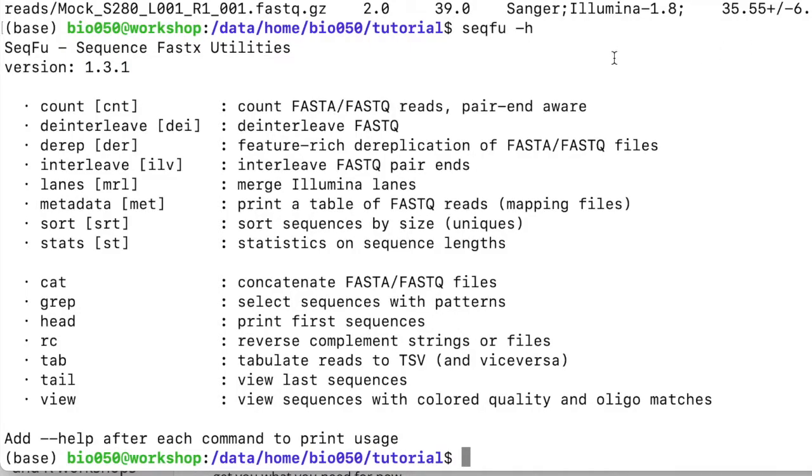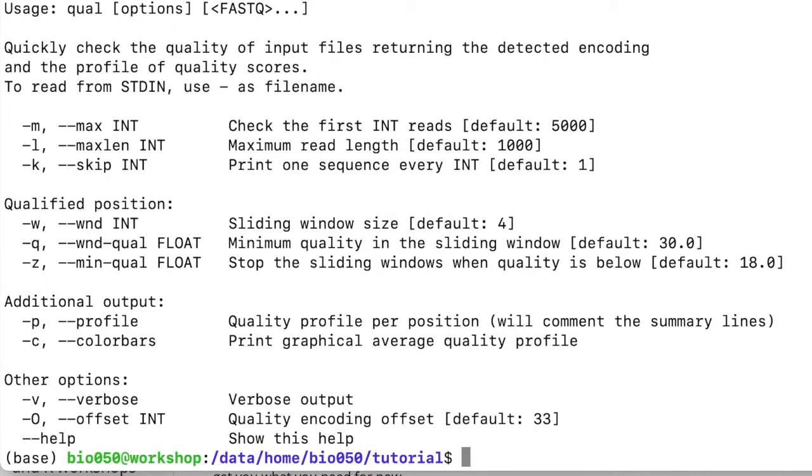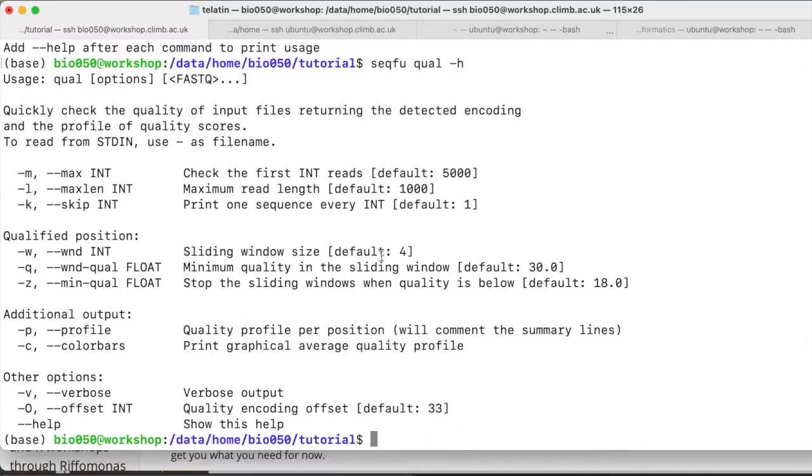So how is that threshold calculated? There is a sliding window, and we move it from the beginning to the end, and we stop when one of the two conditions appears, either when the quality is below a specific threshold, or when the average quality in the window is below another threshold. This is applied to the average quality at each position, so a single read is not affecting the result.